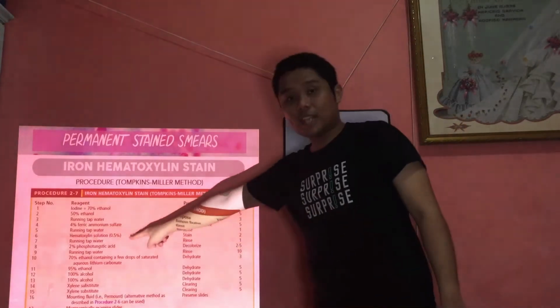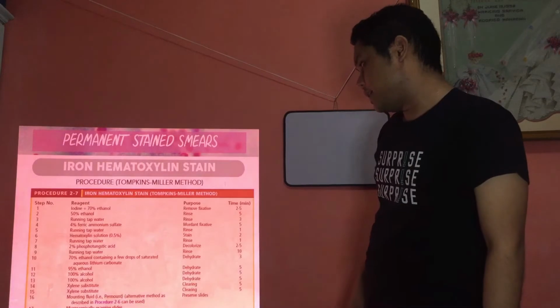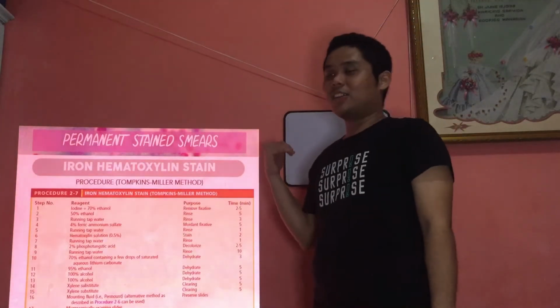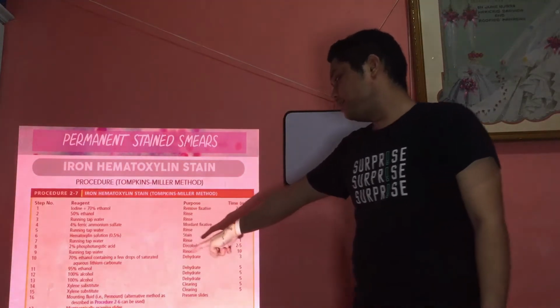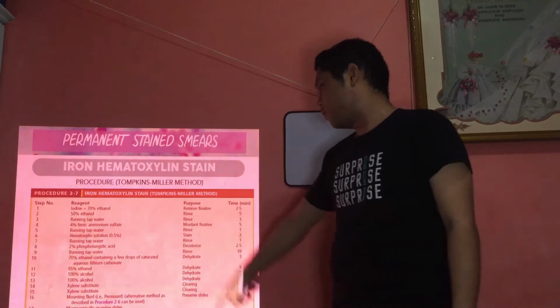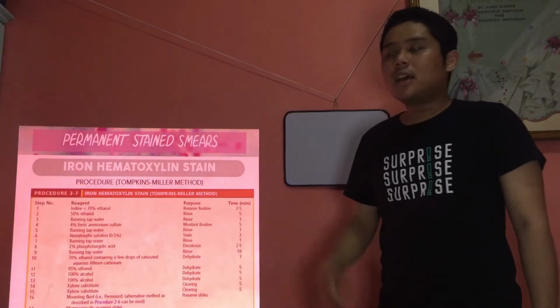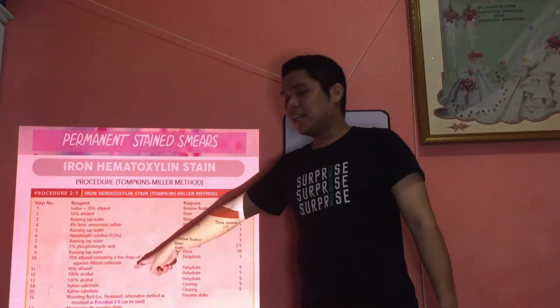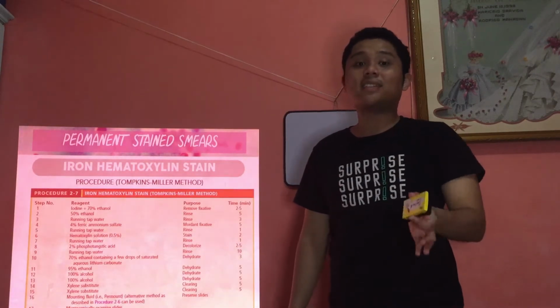You also have 2% phosphotungstic acid which serves as decolorizer. Later, again, I'll check on that in acid fast staining. And then you also have lithium carbonate for dehydration, and then clearing. So the same xylene substitute. As you can see, it's stipulated there, xylene substitute.